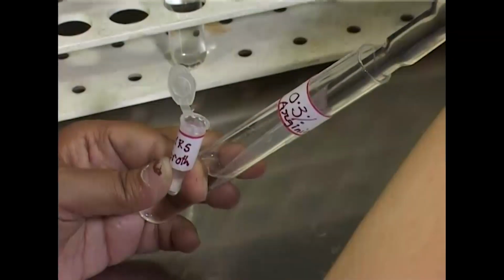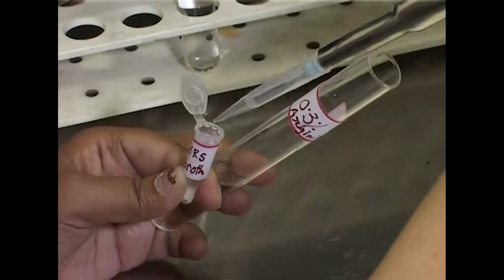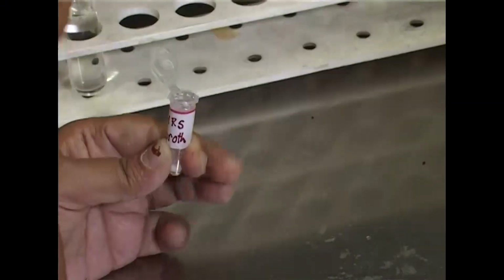Next one, arginine hydrolysis test. 0.3% arginine and 0.2% sodium citrate will be taken within the MRS broth and the ammonia production will be detected by Nessler's reagent. So, all those tests are very specific for the probiotic characters.